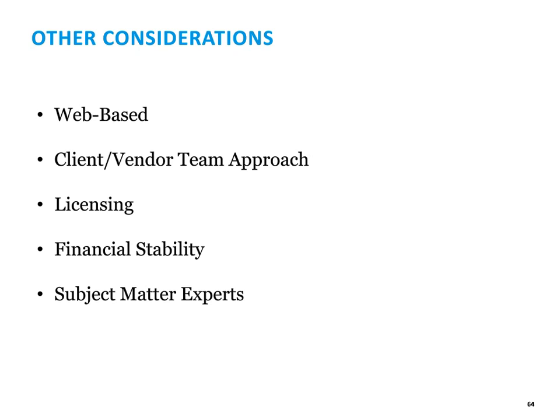And is this vendor financially stable? As we mentioned, this is going to be a long-term investment. You will probably keep your LIMS anywhere from 7 to 10 years or longer. You want to make sure the company that you choose is going to be there to support you for the long run.